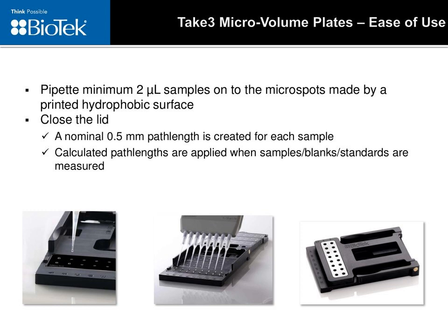Once the apparatus is closed, a nominal 0.5 millimeter path length is created. Within the software, calibrated path lengths are applied to all the sample, blanks, and standard measurements for normalization.